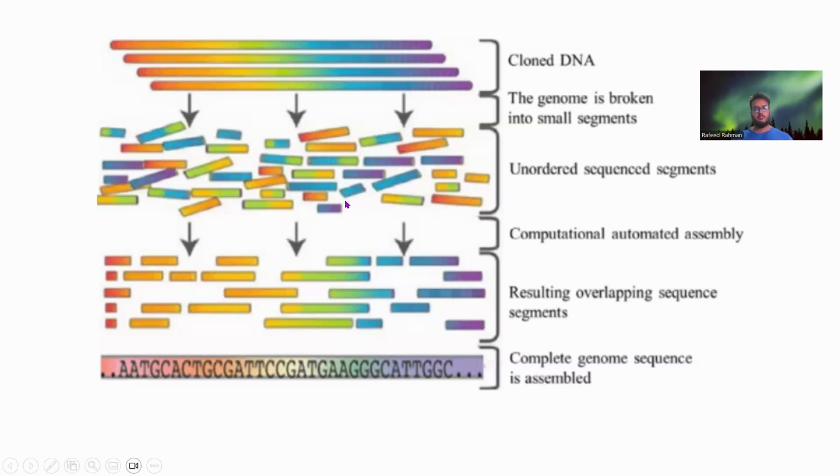It can be some sequencing platform, for example, Illumina sequencing. Finally, now that we know the strings, and since I'm a human, I will need to align my fragments to an ideal human reference genome. So that is what is being done here. All the fragments are being aligned to the reference human genome. After aligning, you can see that in the same position, there are multiple fragments, and so we can very easily take their consensus and find the actual string that should be my own DNA.